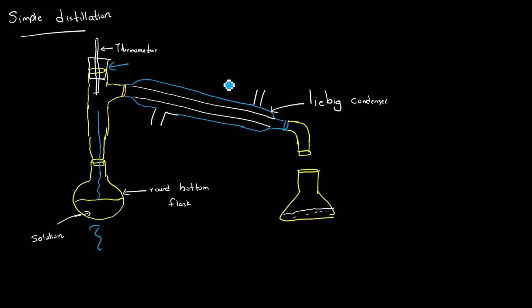Now this is called the Liebig condenser. You can see there's a tube inside like this. This tube is going to carry this incoming vapor through this part. Now these are two entrances where we can input water: water input and water output.